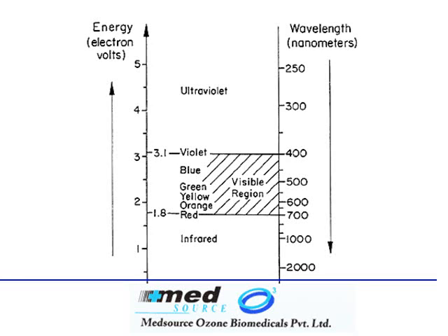However, one cannot compare the absorbance of blue color with yellow color because a dark yellow can have more absorbance than a very light blue. So therefore, we always compare the absorbance only at one wavelength or only at one color.